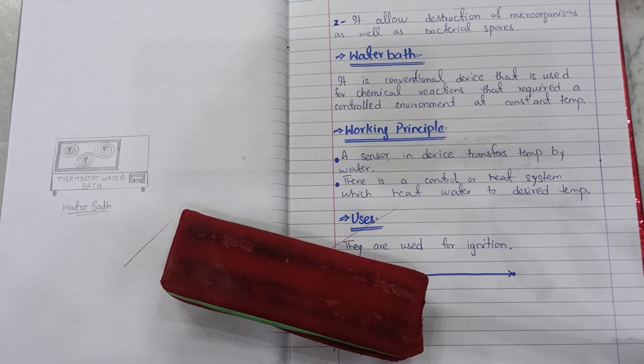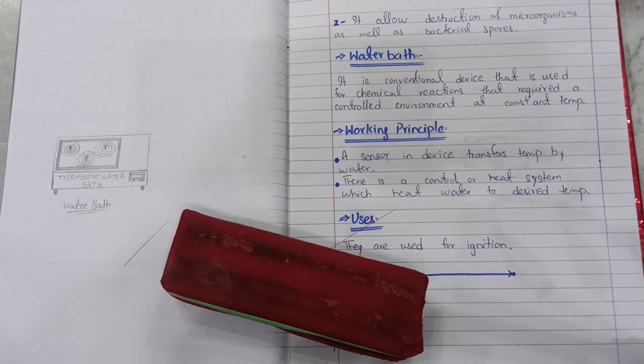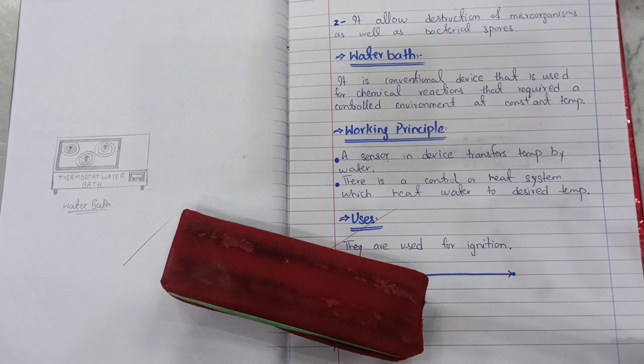So the last thing is that it allows the destruction of microorganisms as well as the bacterial spores which are present on the instruments. And now we have completed the processes of hot air oven. The next instrument and the last instrument is the water bath. That is very important and especially it's used in a lot of experiments.